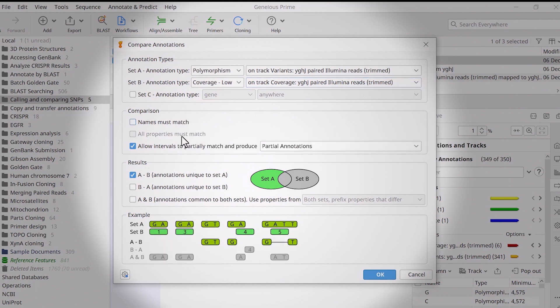Also, check Allow Intervals to partially match, as this will return polymorphisms such as indels that are only partially within a low coverage annotation.